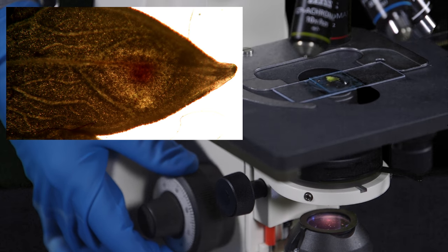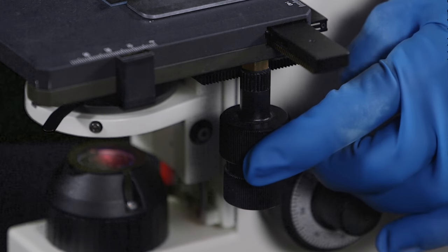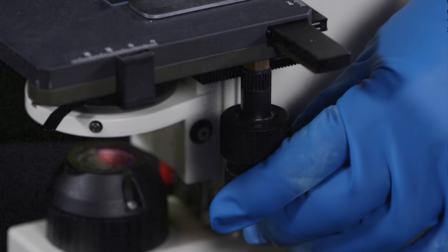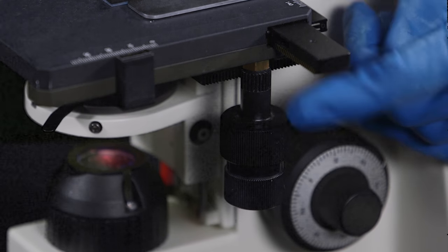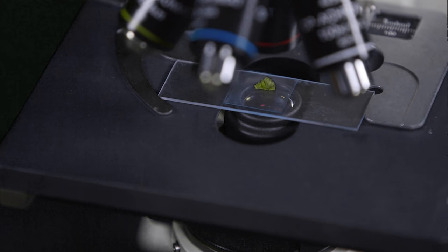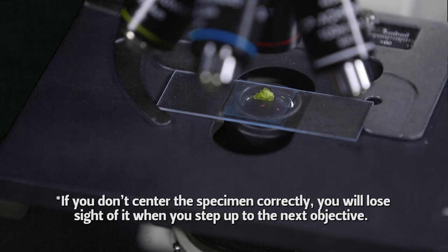When you are in focus with the lowest power objective, use the stage adjustment knobs to center your specimen in the field of view. Use both knobs. As you look through the oculars, one of the knobs will move your field of view horizontally, the other vertically. The stage will move side to side and back and forth.